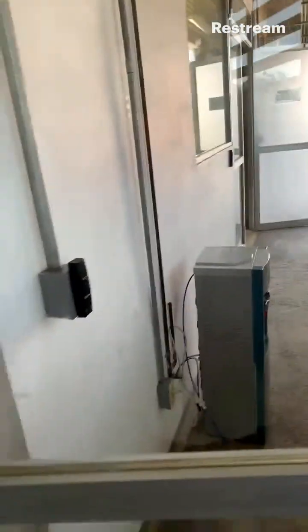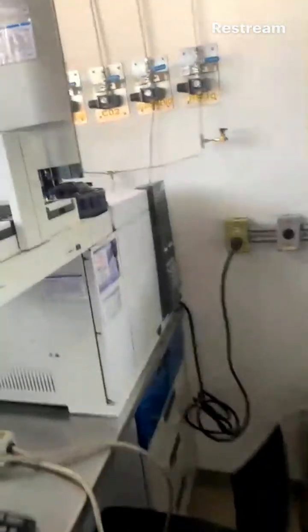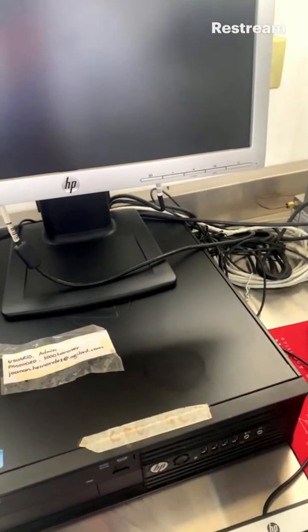I went to open the gas. I would also open the gases here. I'll have to turn on the system.